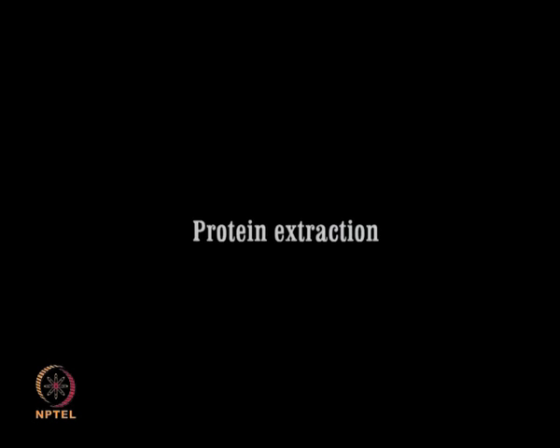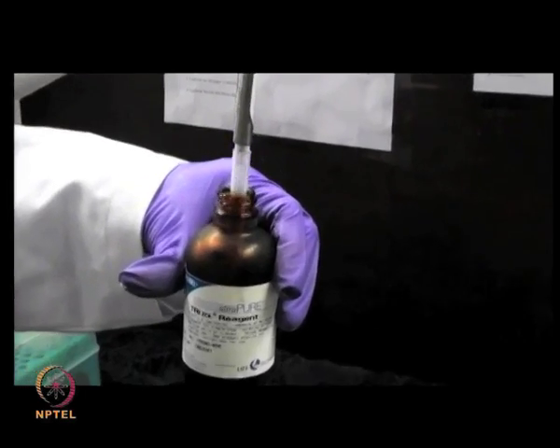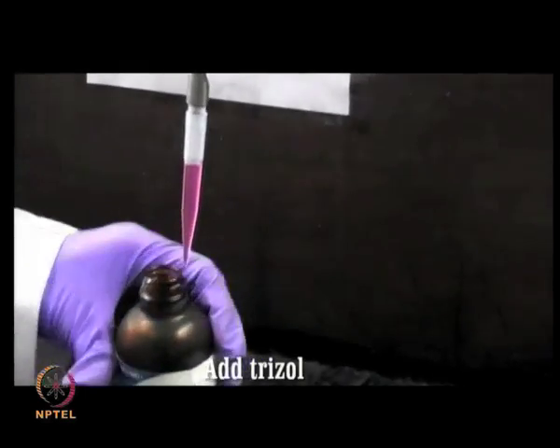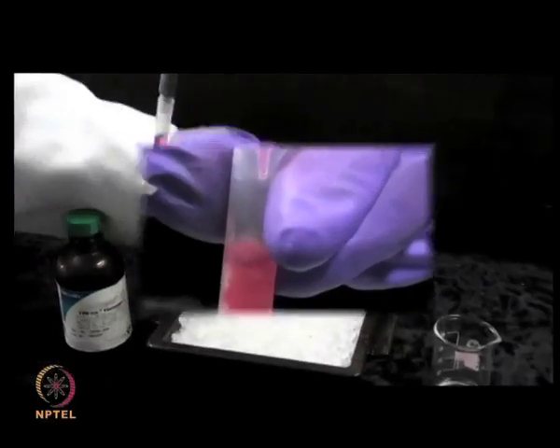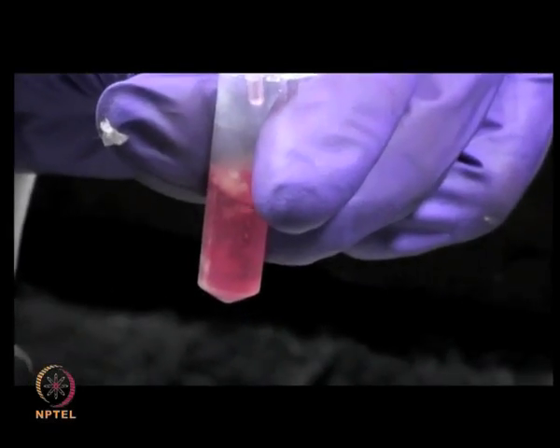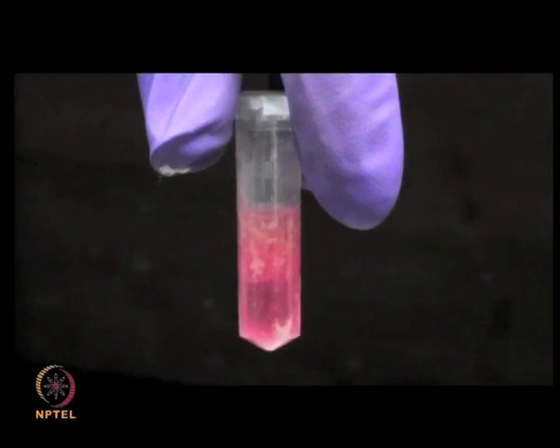The trizol extraction protocol allows efficient separation of not just the bacterial proteins but also their DNA and RNA. Add the trizol reagent consisting of guanidinium thiocyanate, phenol and chloroform to the supernatant obtained after sonication.